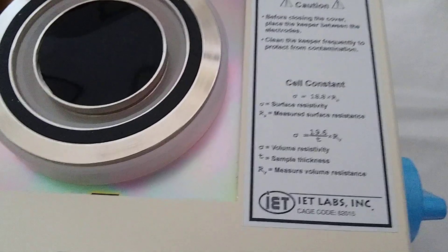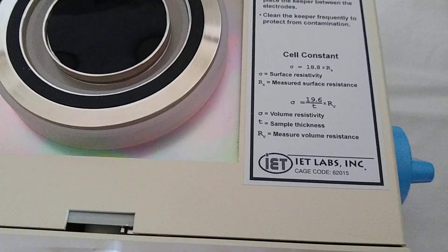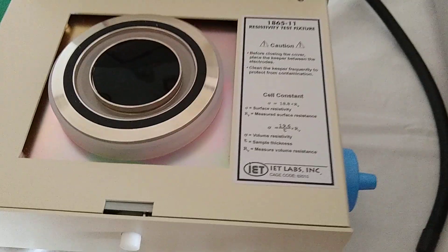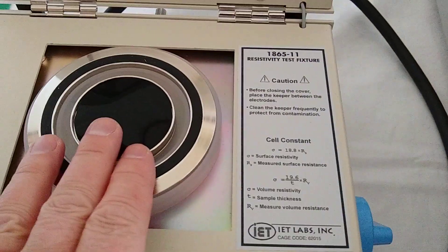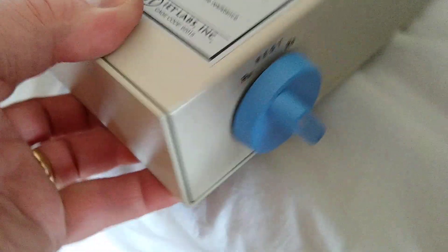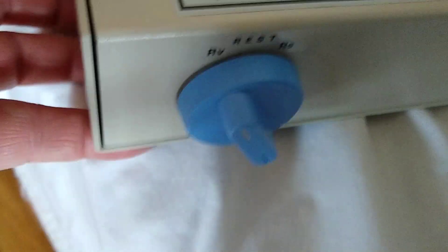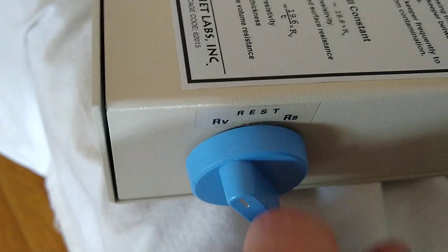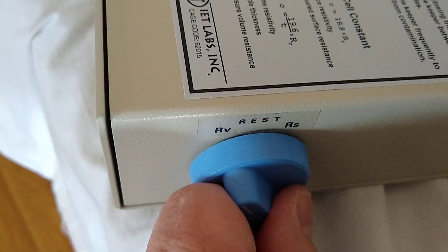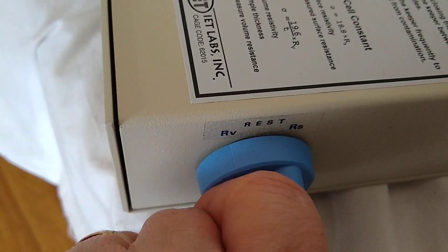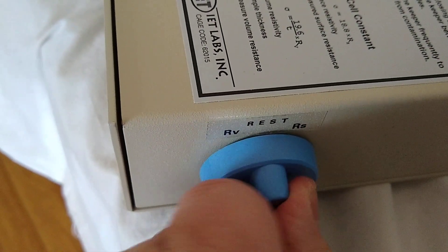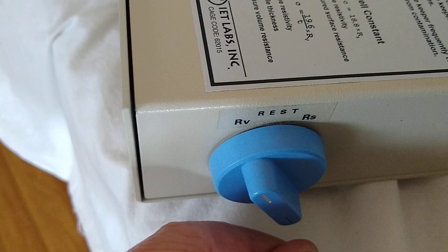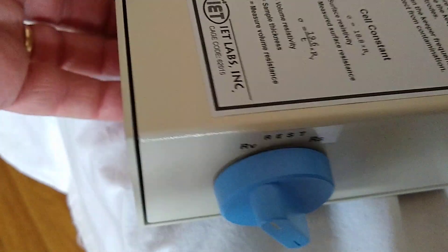In preparation for zero, what we'd like to do is make sure there is nothing touching the electrodes. If you look at the side of the volume surface resistivity cell, you can see there's a selection, RV, rest, RS. Turn it over to RV because we're going to be measuring volume resistivity.